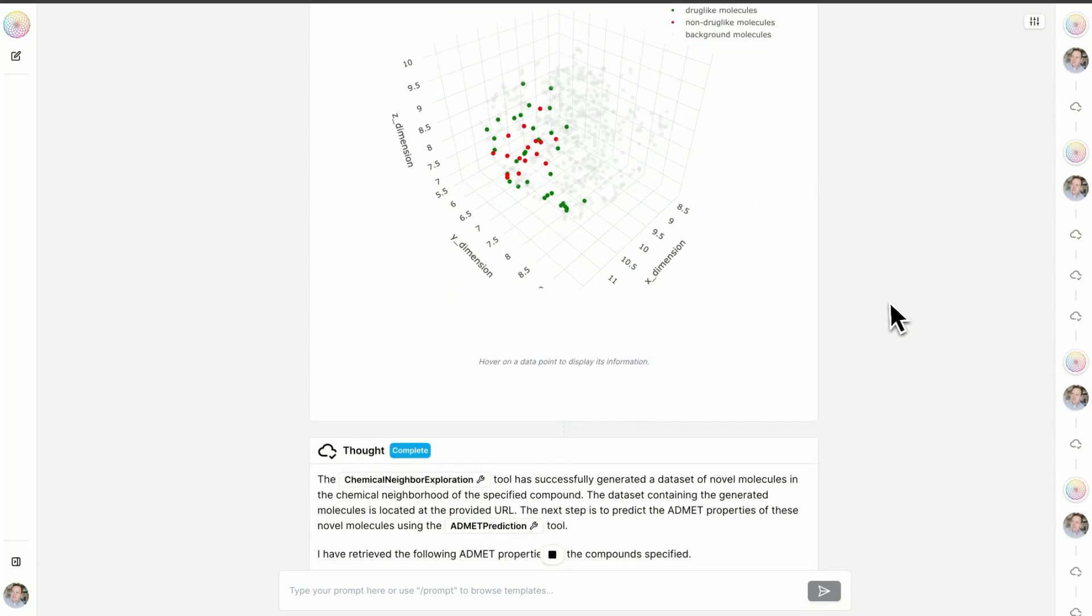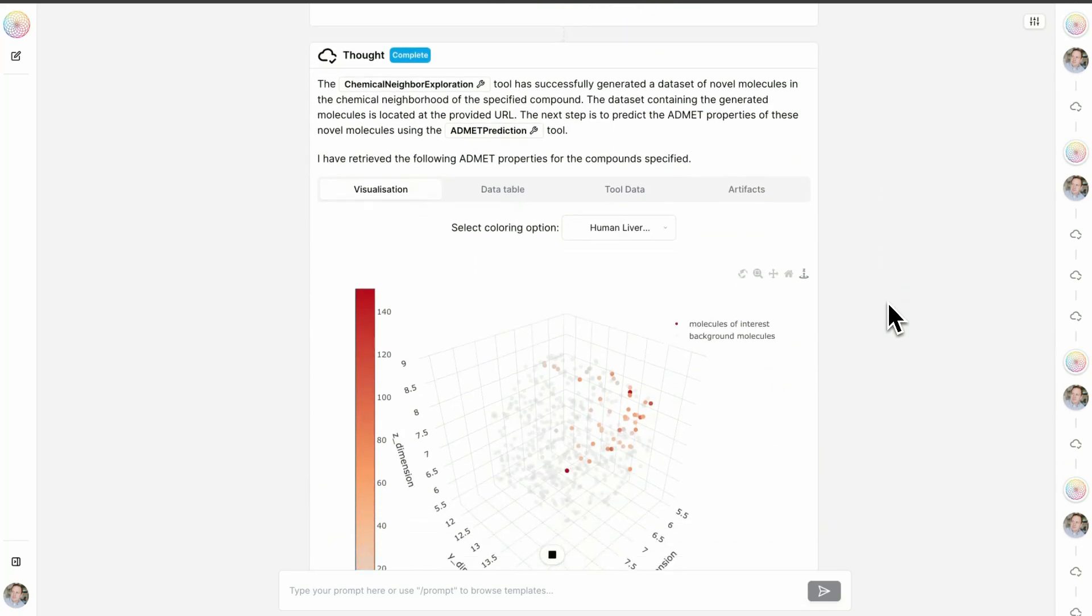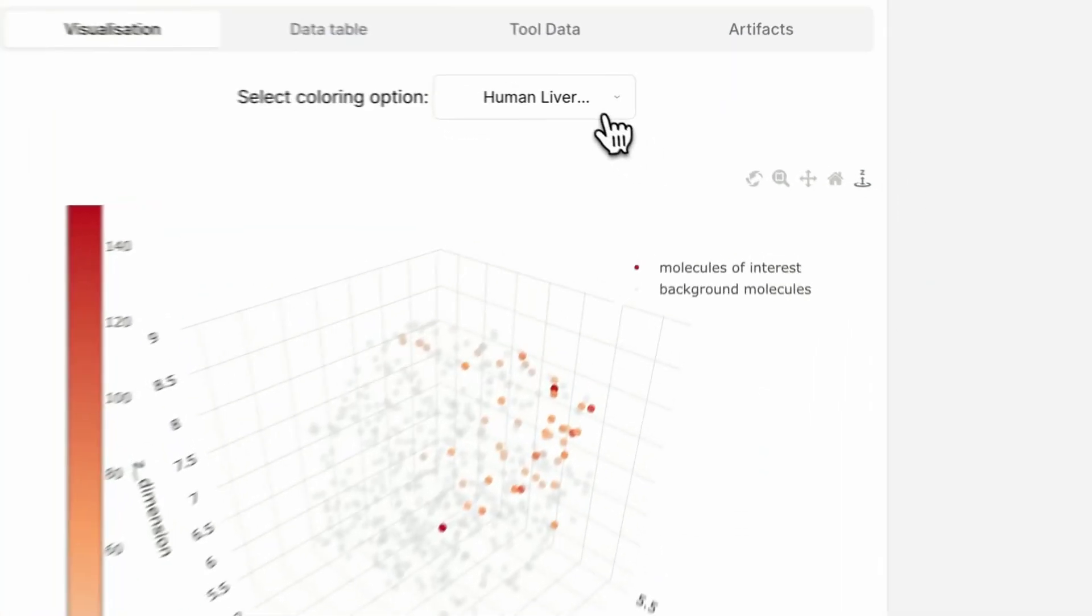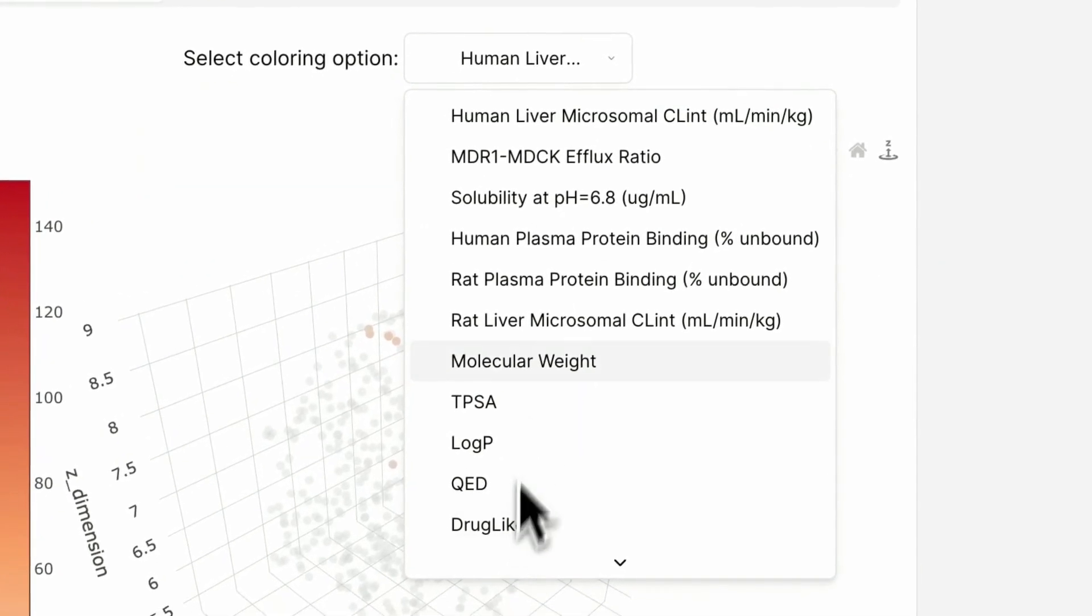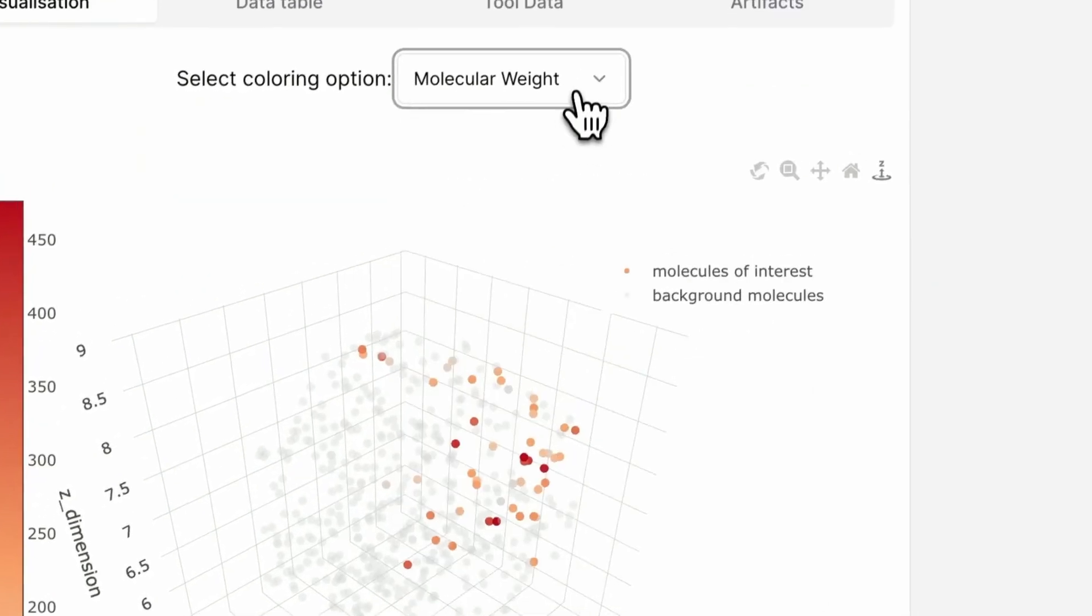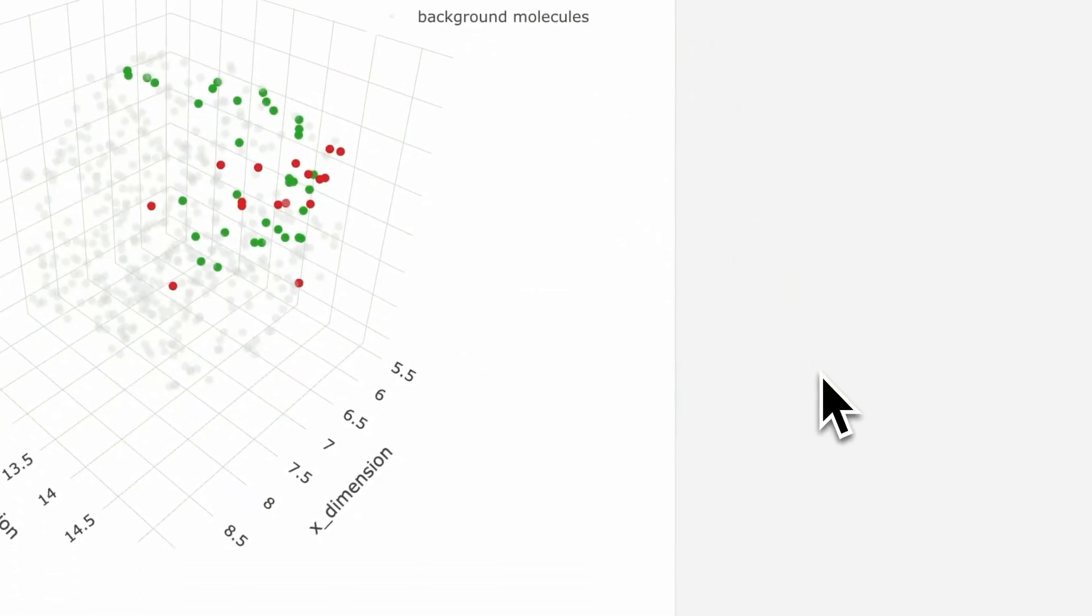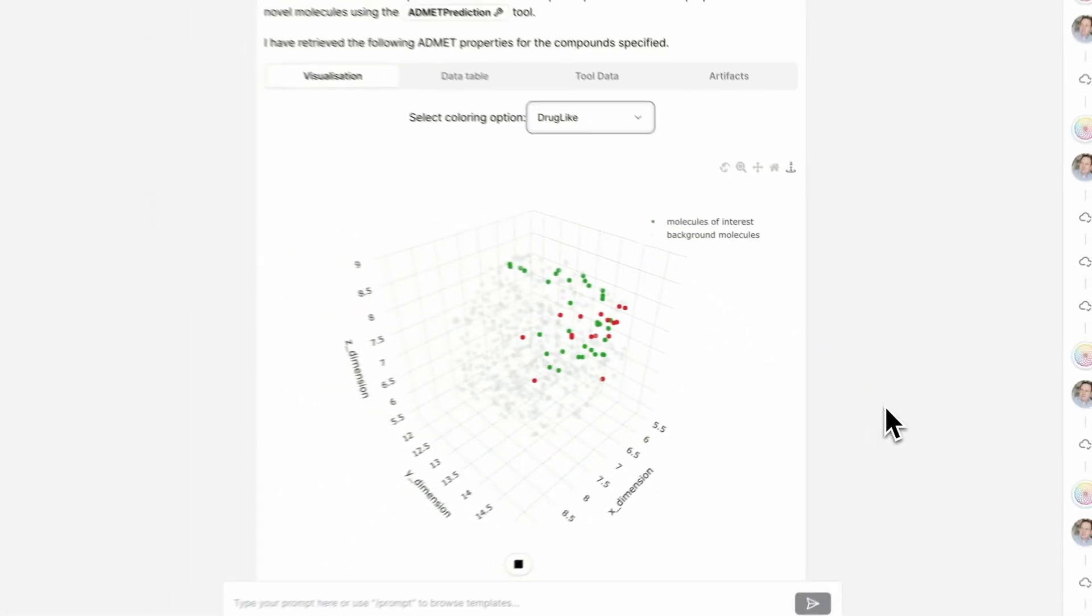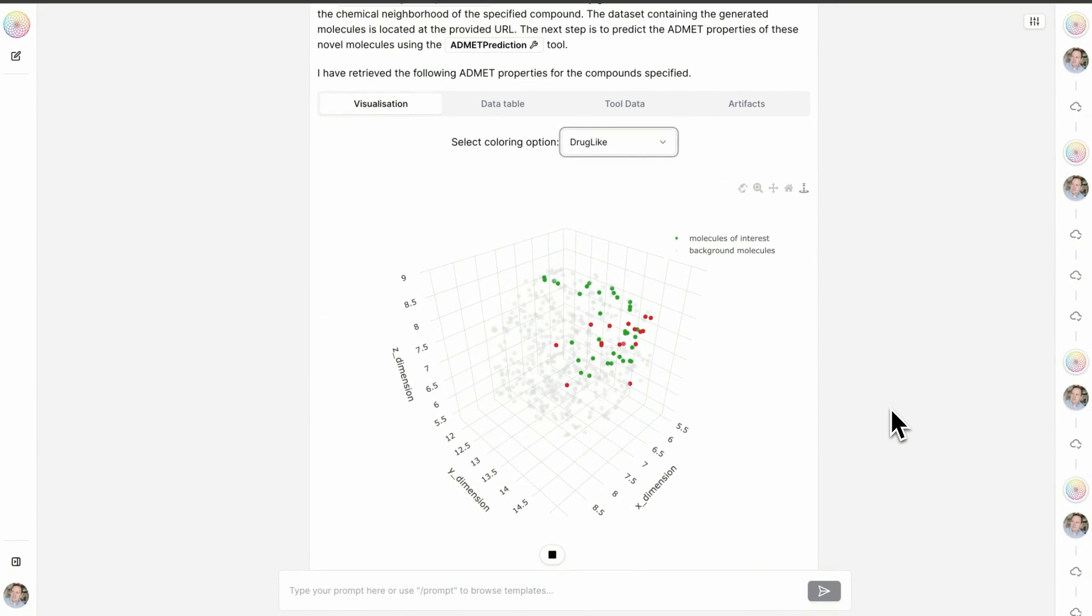So we could order these compounds through custom synthesis. We could base this off of some of their properties, for example, their drug-likeness, and then we could kick off the next round of SAR.